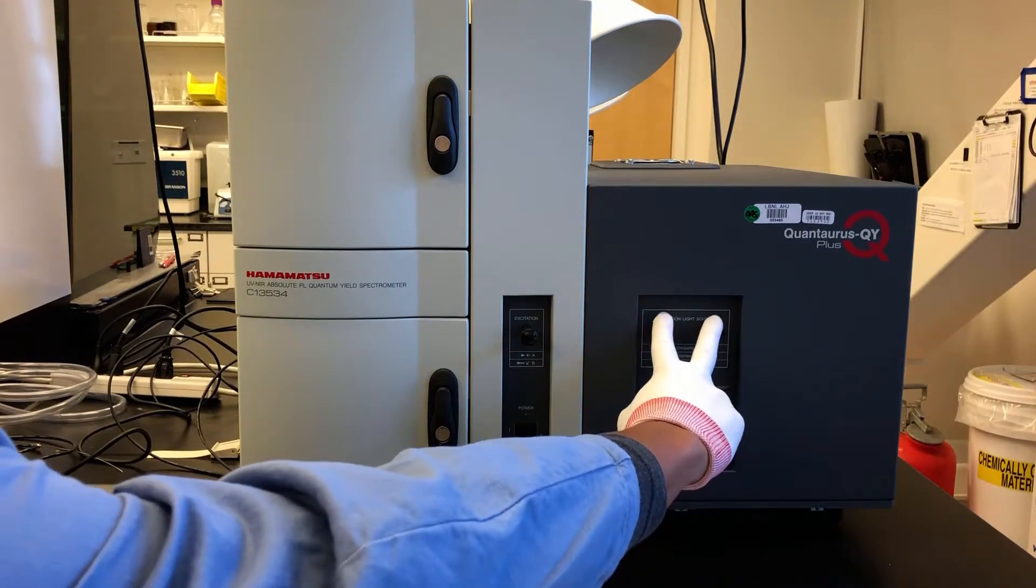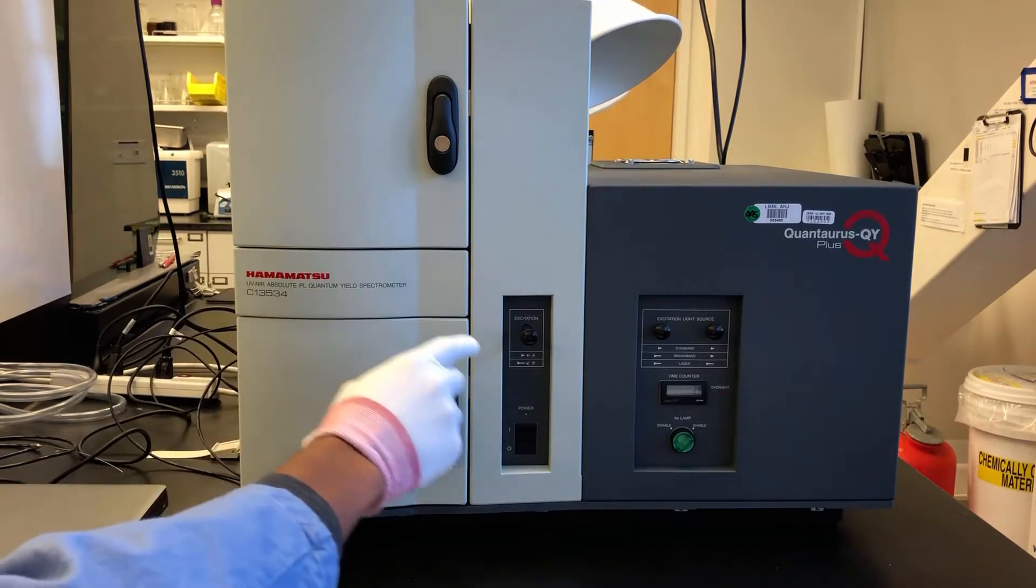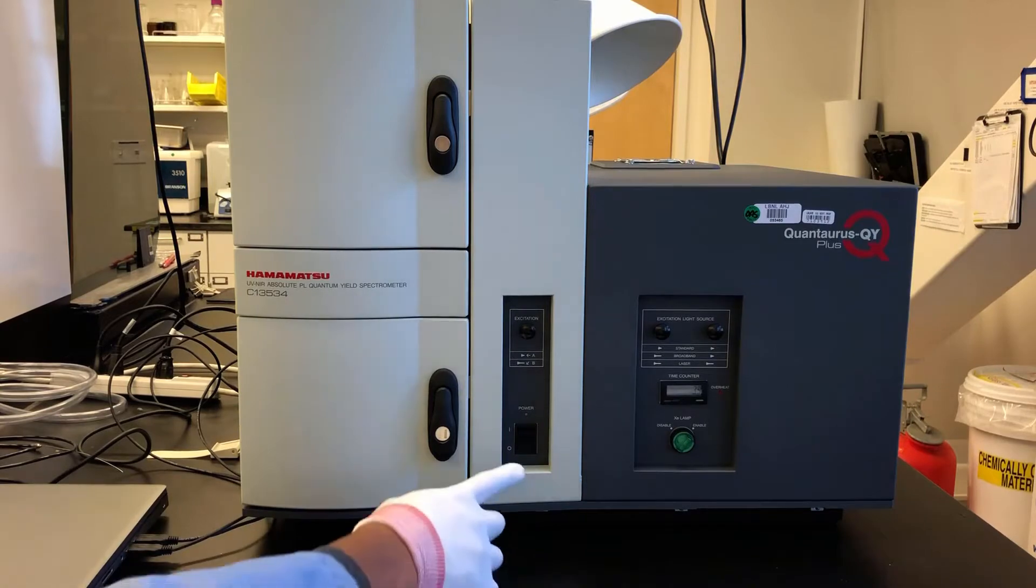To start, press these two knobs on the right to choose the monochrometer. We'll be loading the top chamber so I'll choose excitation source A. Then press the power button.